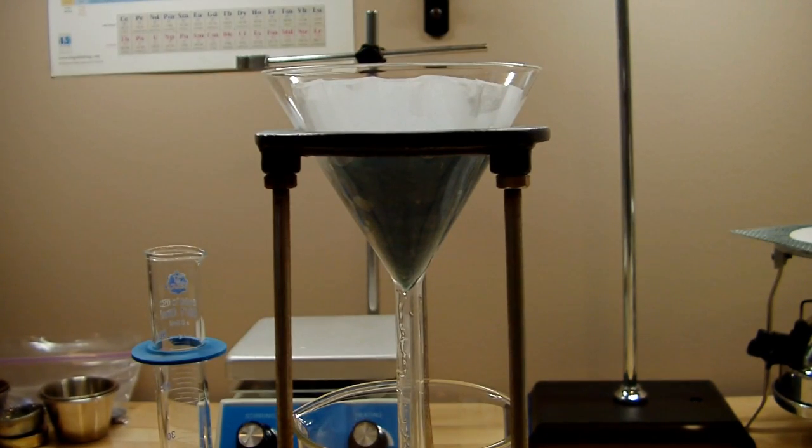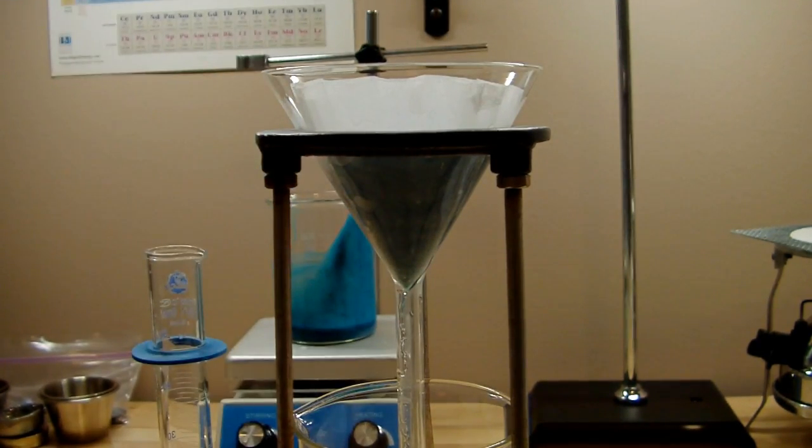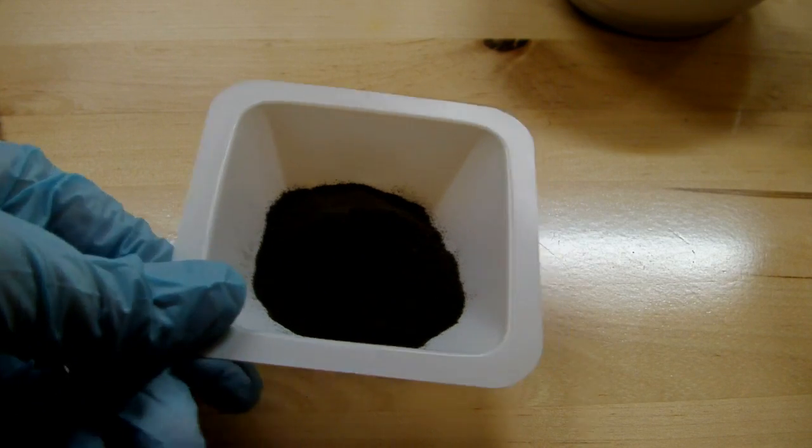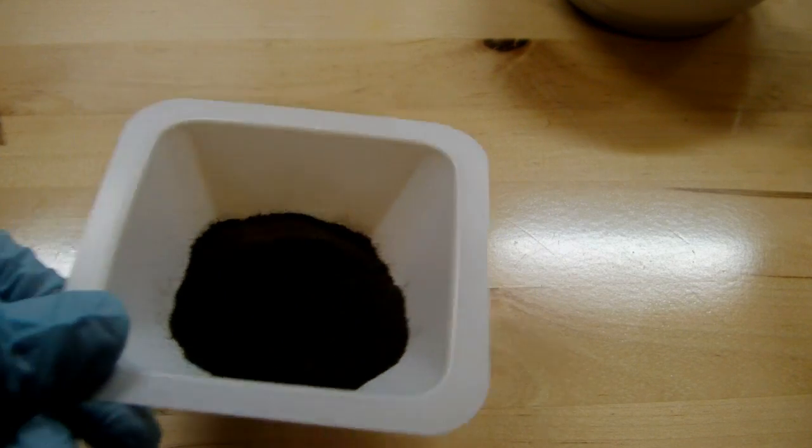So my whole sample of copper hydroxide turned into this black powder of copper oxide, and so that was the failure as far as the Schweitzer's reagent goes.